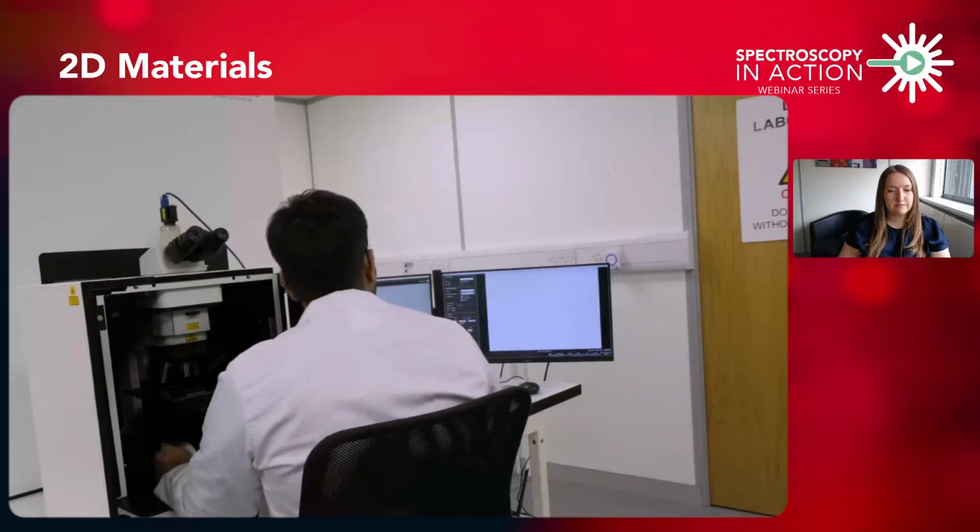Currently, I'm set into bright field illumination, which we're going to use to help focus the sample. So now we're going to look around on the sample to find some flakes of the molybdenum disulfide. And here we've identified two very nice looking flakes of the molybdenum disulfide.